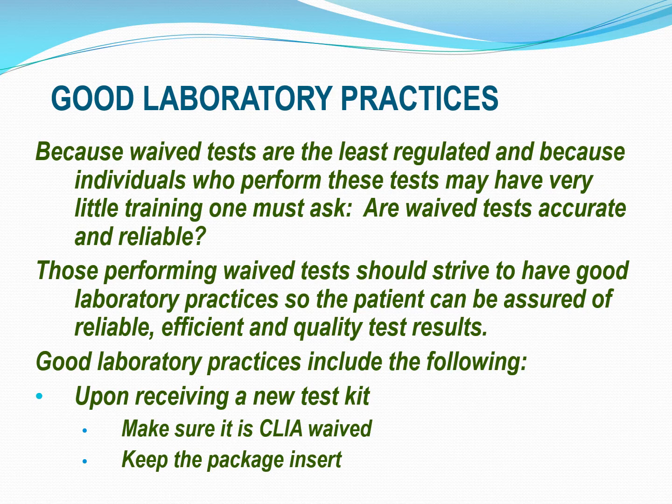So when we're talking about good laboratory practice, they include the following things. When you get a new kit in, first you want to make sure that that kit is CLIA waived. You want to keep that package insert, and you can have a three-ring binder or a filing system of some sort inside your lab so you can take the newest package insert from your kit and make sure that's the one up front that everybody's looking at, because you don't want them looking at an old package insert from another kit, because these kits can change and vary in the way they're done from kit to kit. So you always want to look at any new kits you open up.